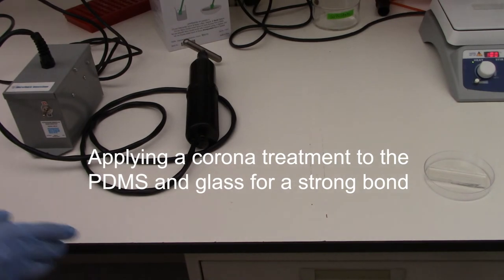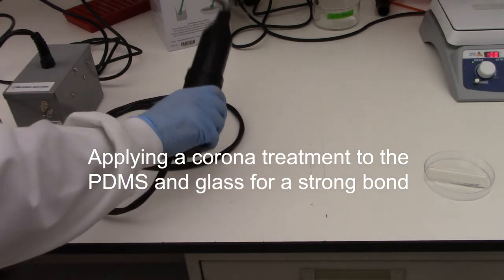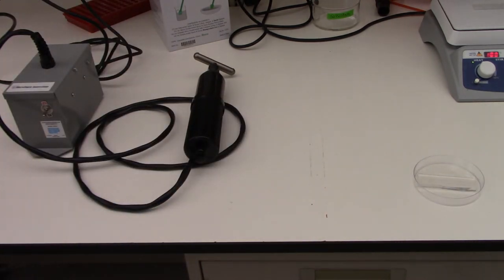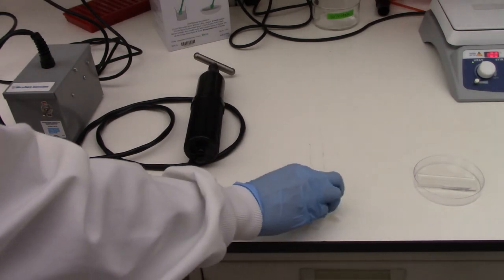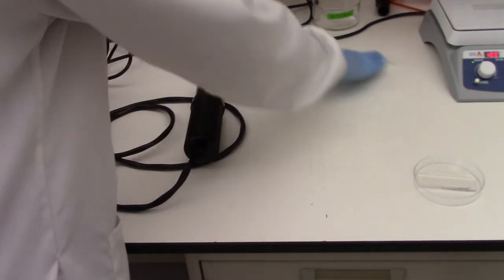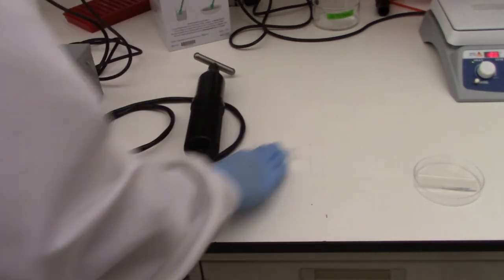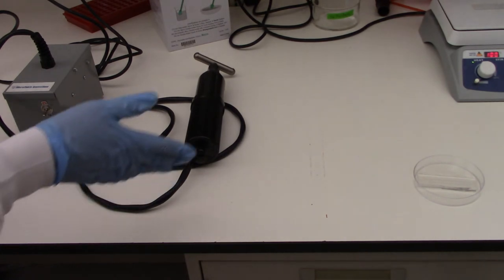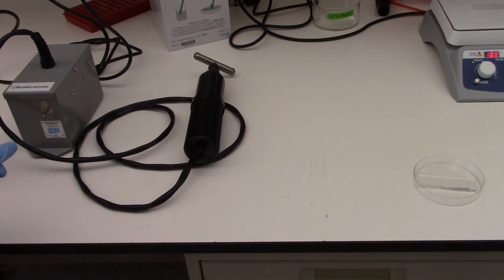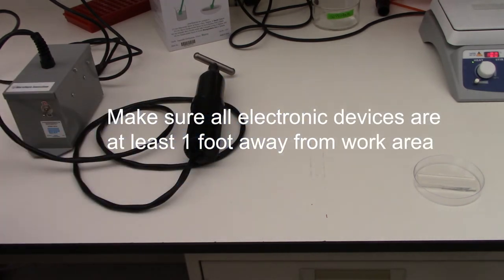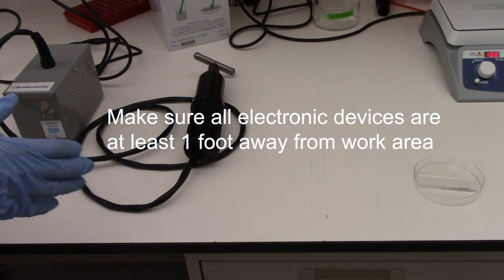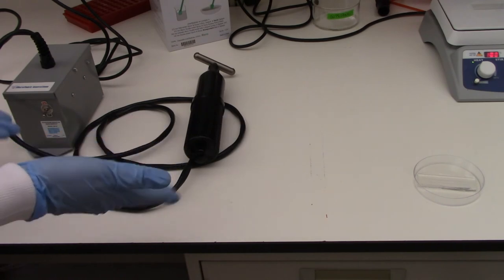So next we're going to use this plasma wand to bond our PDMS chip to our glass slide. To get started with this process, the first thing we do is take some solvent like isopropanol or ethanol and clean our workstation. And we want to do this on a clean surface. And then the next thing we'll do is make sure that all electronic devices and any metal objects are not in your workstation, as the plasma can interfere with some electronics and also the metal messes up the process.